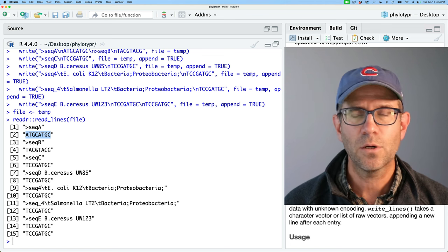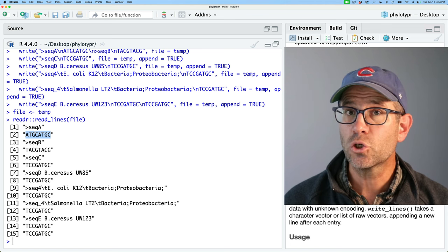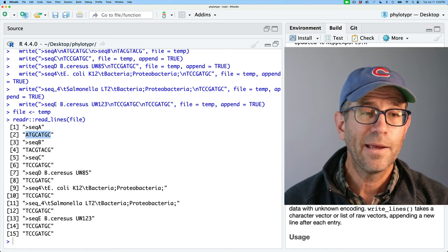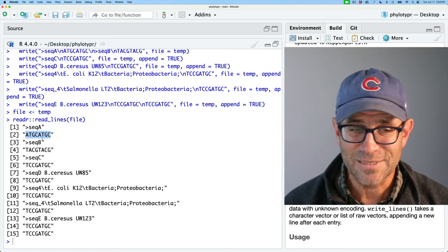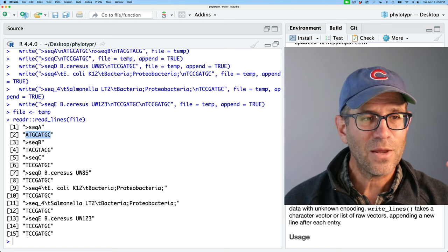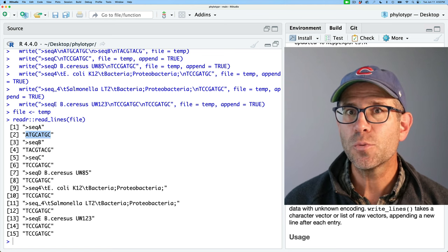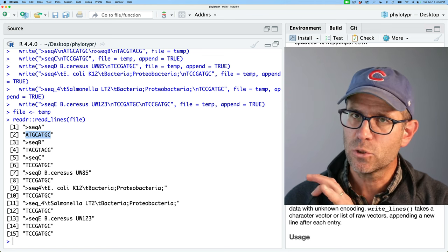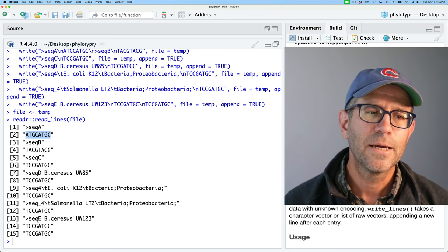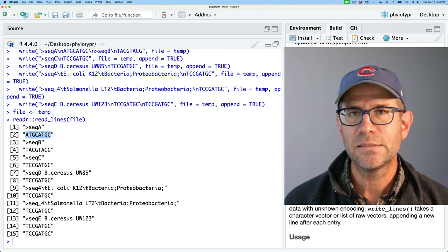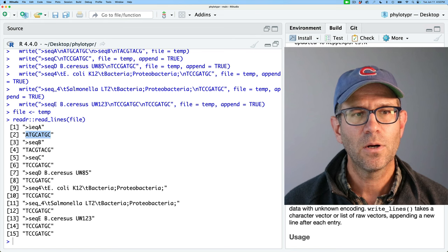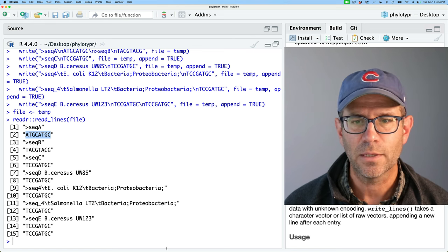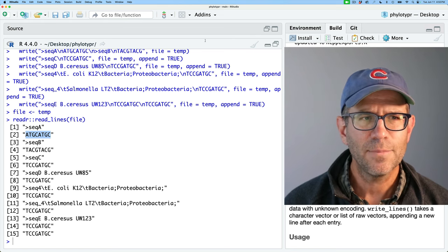And then what I could do is a cumulative sum across those TRUEs and FALSEs to get the sequence number for each header line. Let me show you what I mean. We'll define that using stri_detect_regex looking for the greater-than sign in fasta_data, which gives us those TRUEs and FALSEs. Then if I take this and pipe it into cumsum, it's going to tell which sequence belongs to each ID.